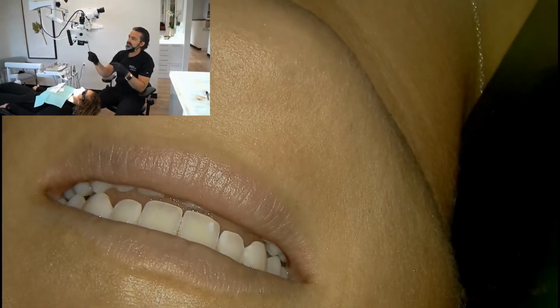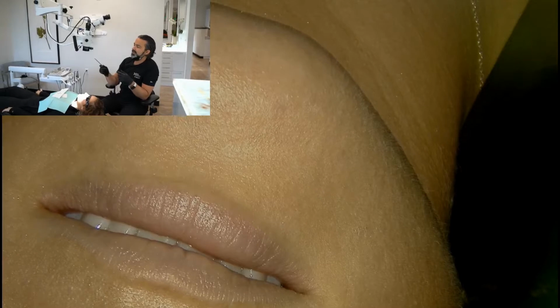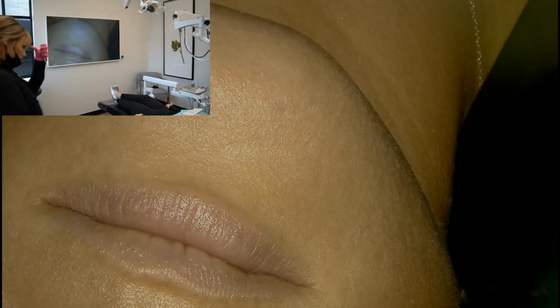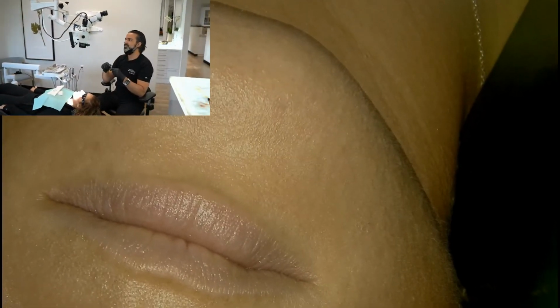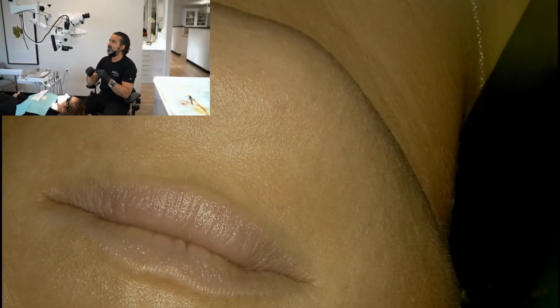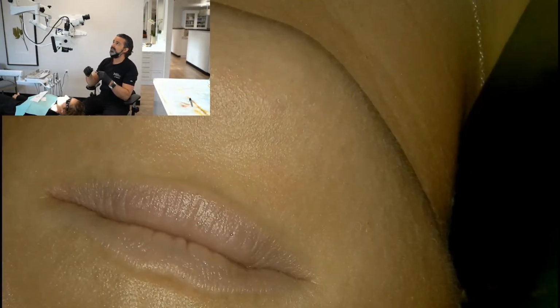The other thing is, we're not really practicing right now, but there will be lens caps that you can put on for splatter on your lens, and a bag that you can put over your microscope so you're not constantly wiping it down when you touch it, especially if you're doing surgery with bloody hands. You'll have to address that by cleaning the underside of that lens early and often.